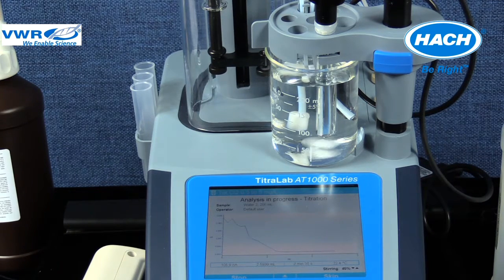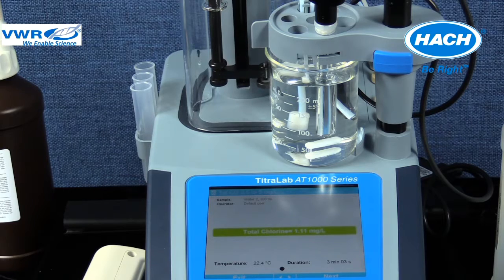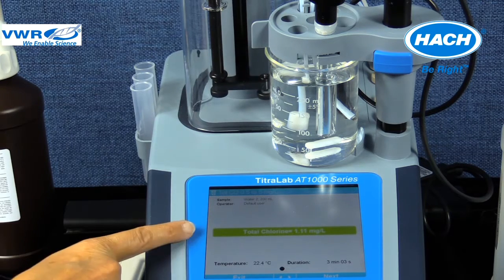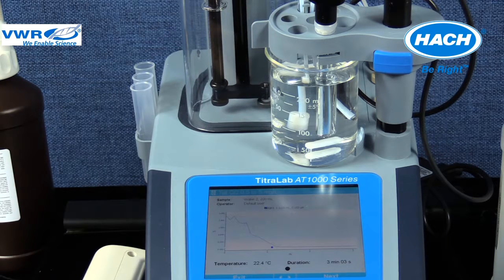When the software has measured the endpoint of the titration, it will automatically stop any further titrant addition and stop the analysis. The titrator will display processing result and advance to a results screen. The total chlorine concentration results are detailed in green, as well as the sample temperature and the time duration of the titration analysis. The black dot at the bottom of the screen indicates that there are subsequent screens of information.